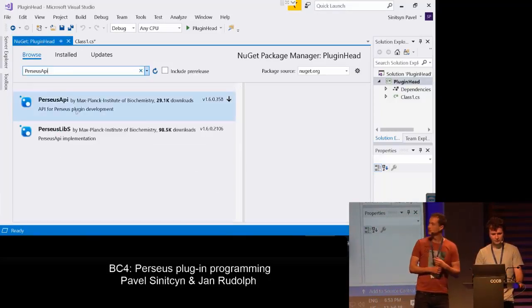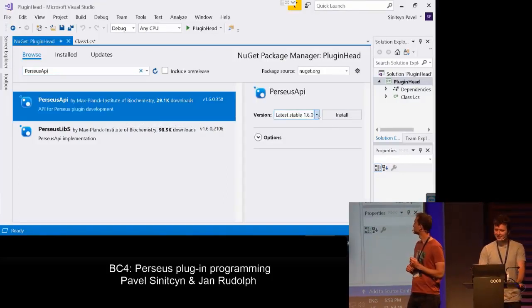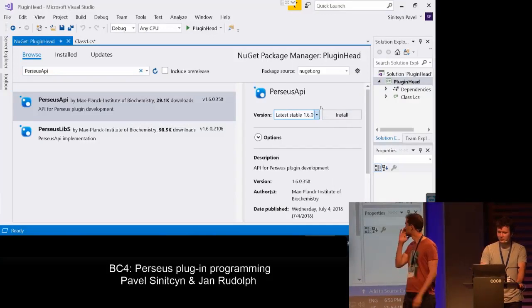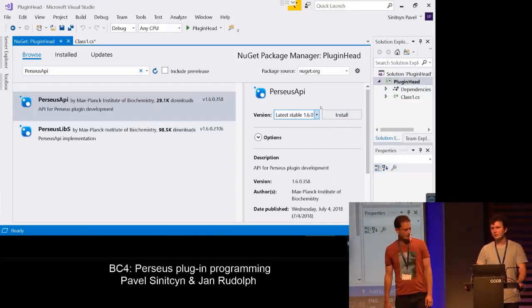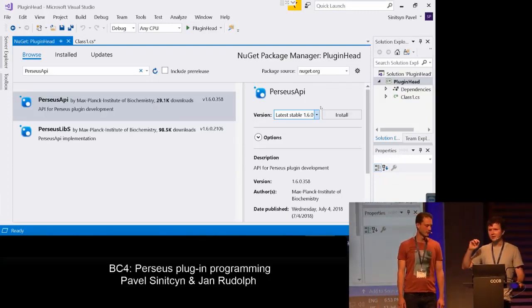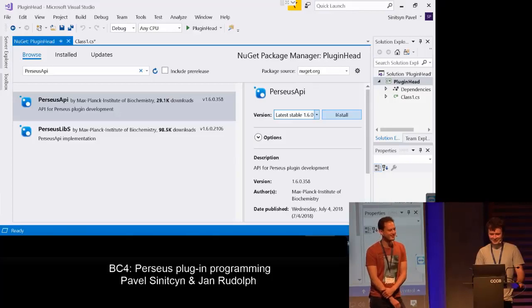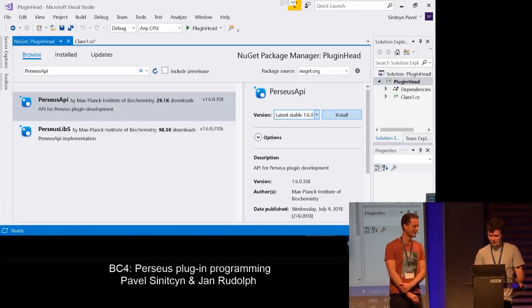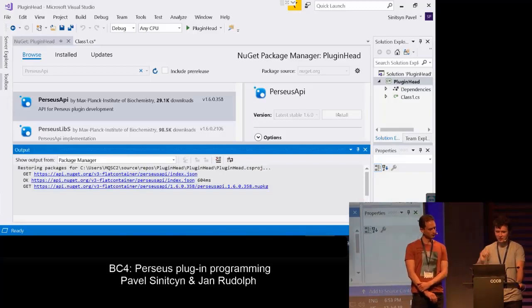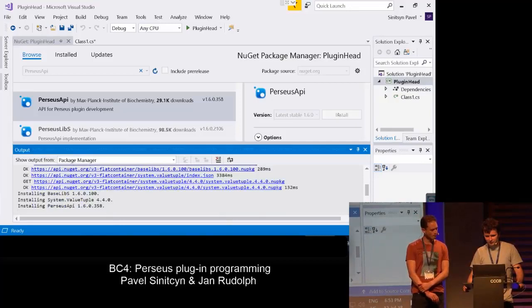So voila, it showed up. Who is this guy? Anyway, okay, we can install. One of the coolest things about NuGet is that you can construct all infrastructure in a way that you will get the freshest version of the library you're searching for. Okay, so just clicking install, and let's hope that all the red color will leave us.